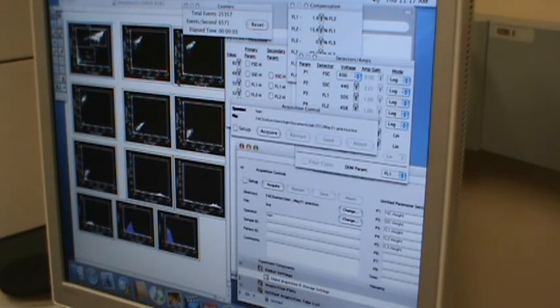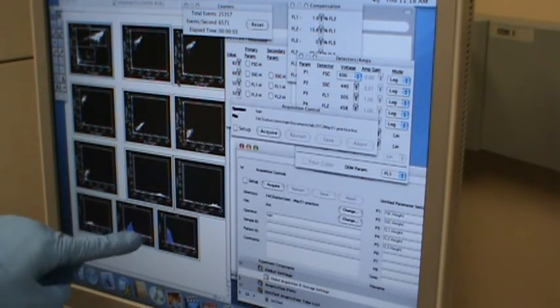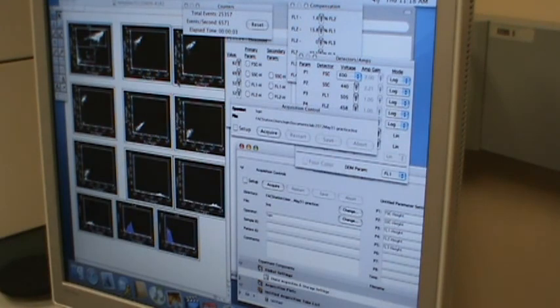Okay, now we are going to do the second one. That will be half live, half dead, I guess. So are all white cells going to be blue? Is that why? No, the blue is different. The blue actually shows just to highlight the peak. It doesn't mean the cells are blue. Okay.